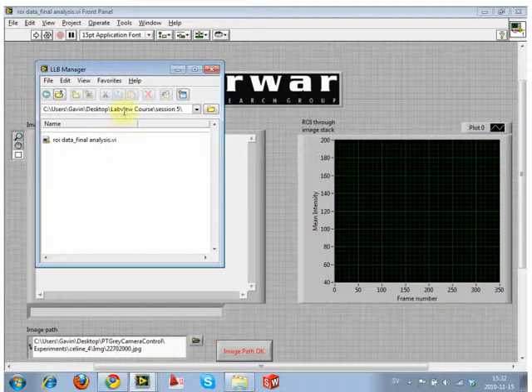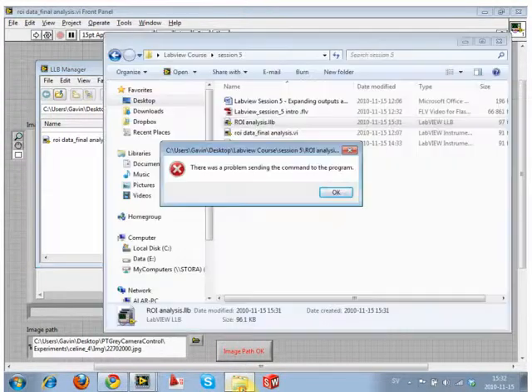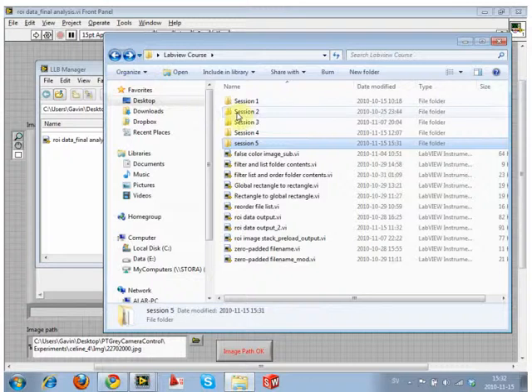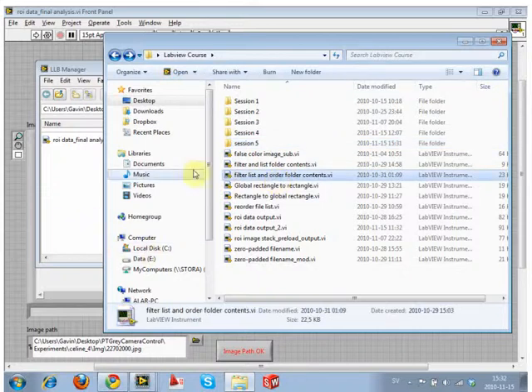There's a lot of programs that you are going to want to actually carry these over with, especially ones which aren't used that often. Ones that you use quite often, you could put just in the LabVIEW folder in the program files, if it's something that you use an awful lot, because then it's always there. But for the ones that you don't use that often, we can just take the VIs and drop them in.